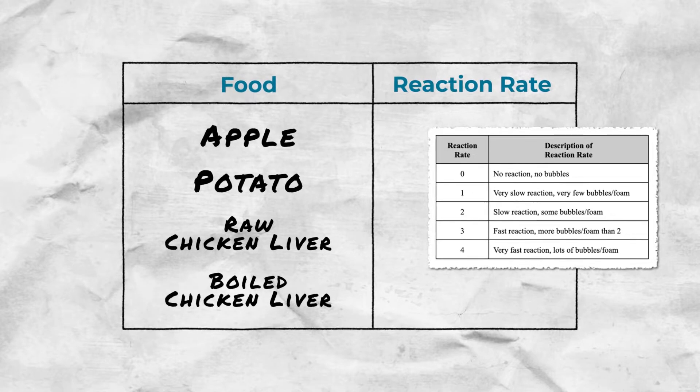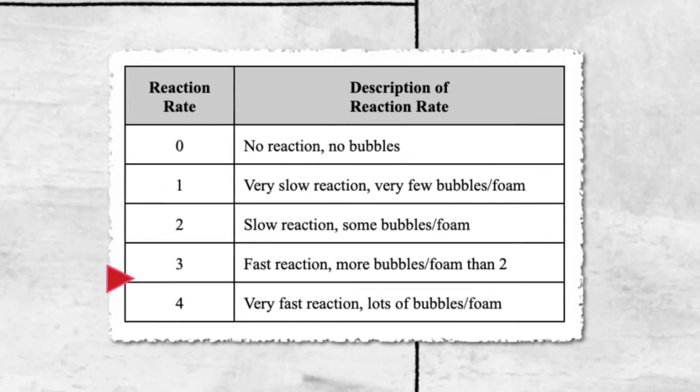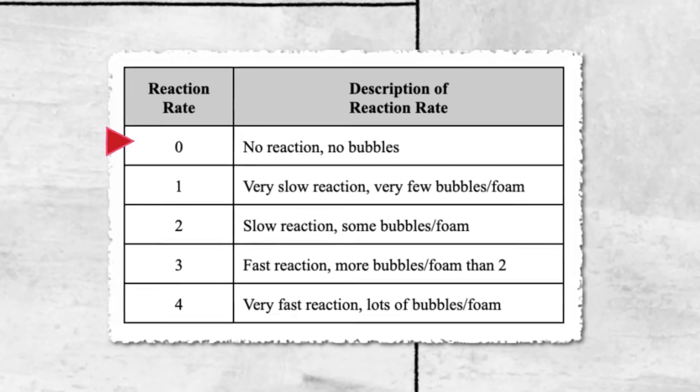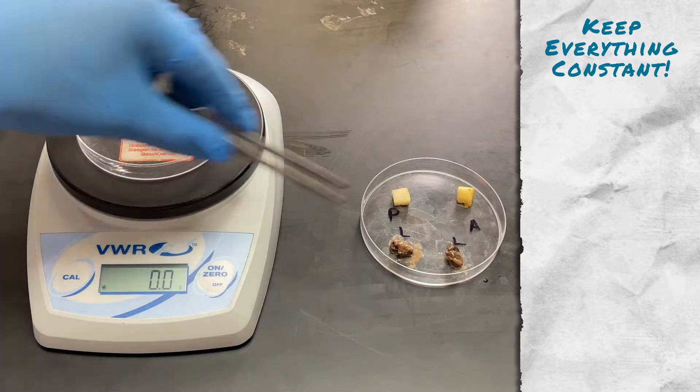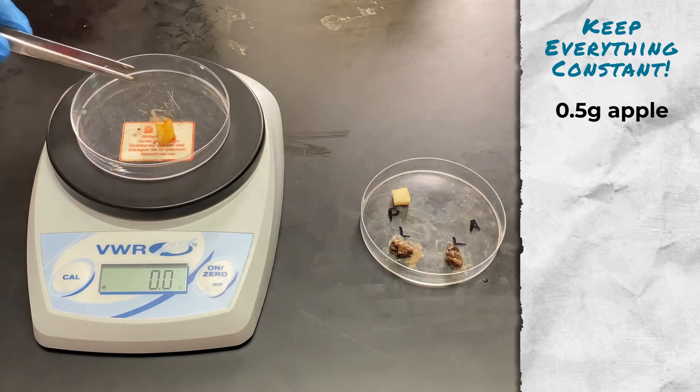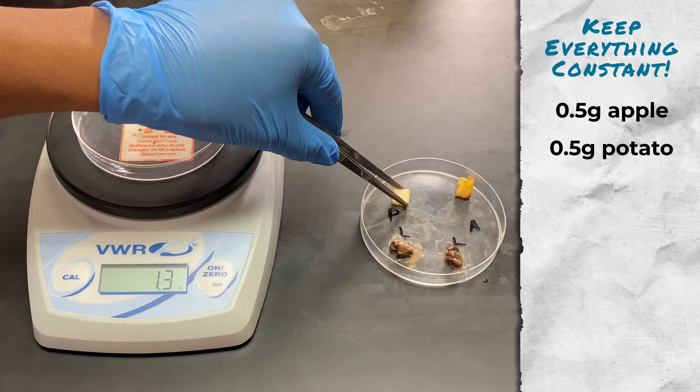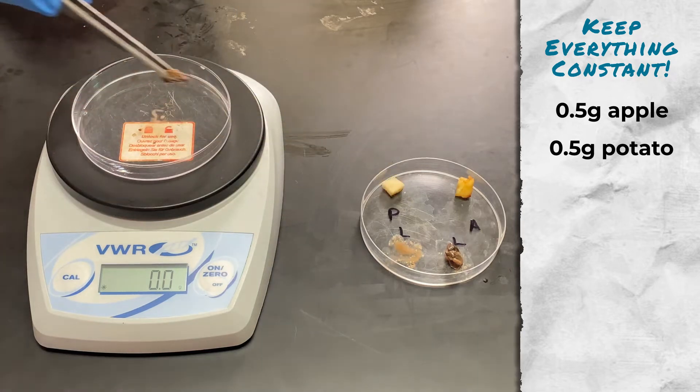We will see which foods contain the most catalase and will break down the peroxide the fastest. We're using 0.5 grams of an apple, 0.5 grams of a potato, and two pieces of liver that each weigh 0.5 grams.